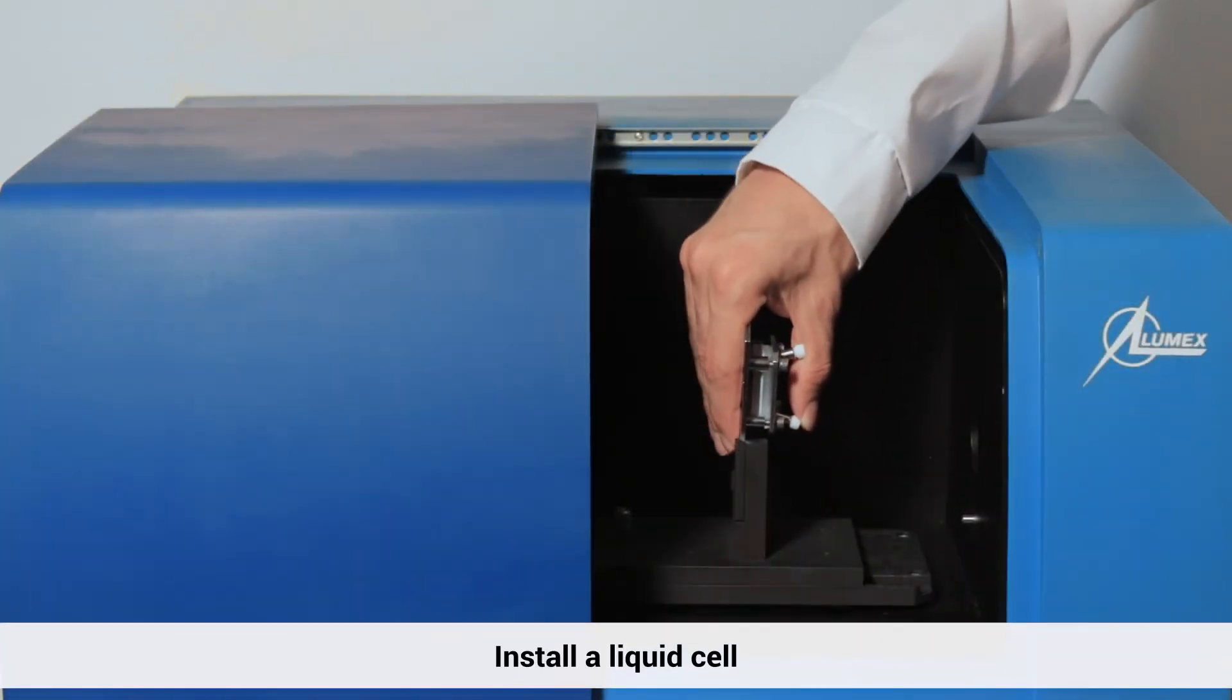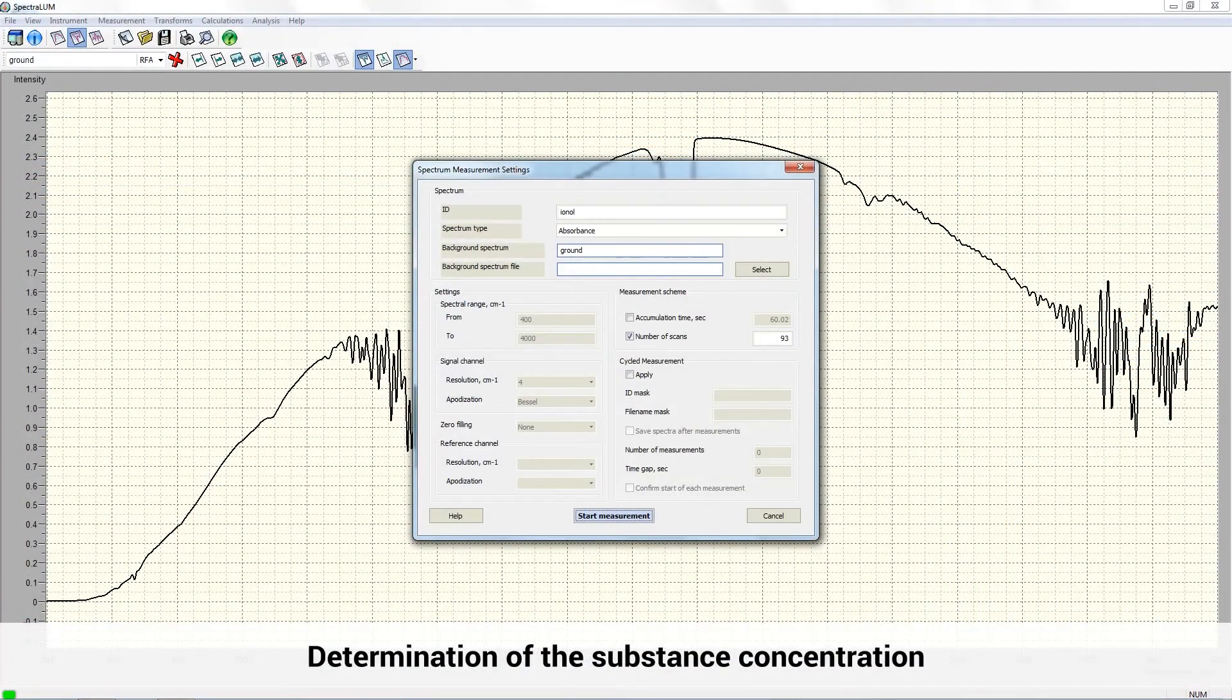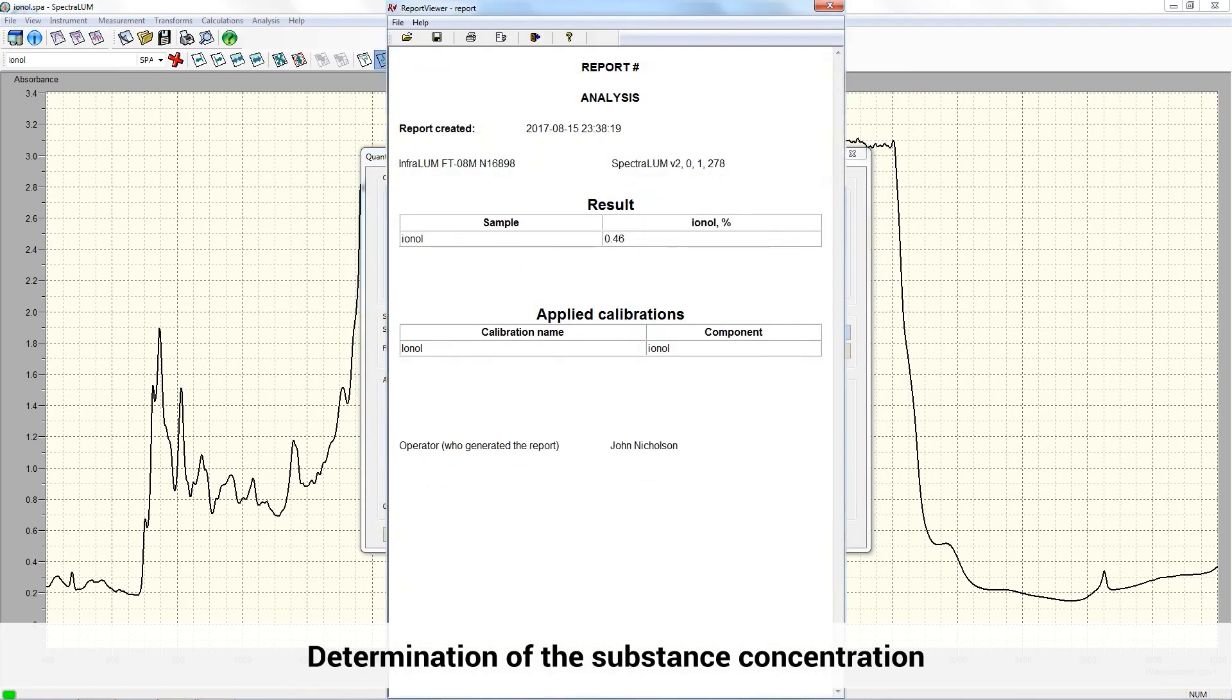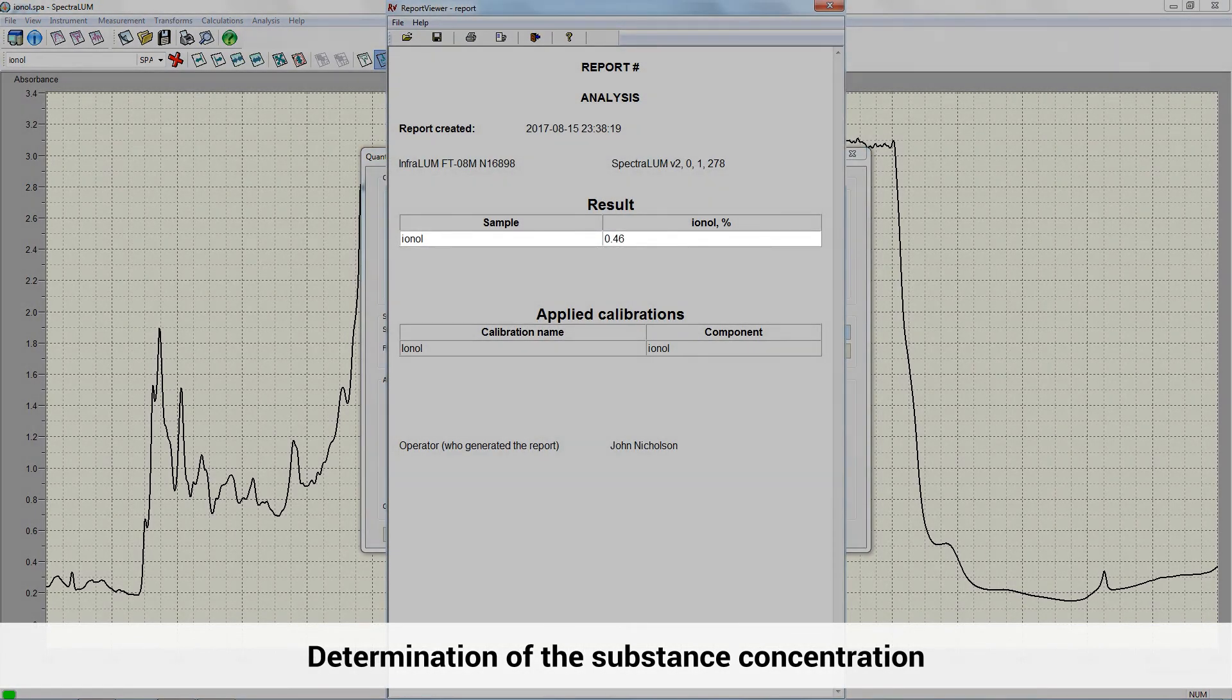Let me show you one last example. We will conduct a quantitative analysis of substance. We are installing a liquid cell containing the oil sample and starting the measurement. Now, according to a pre-established calibration curve, the substance concentration in the given sample is easily determined.